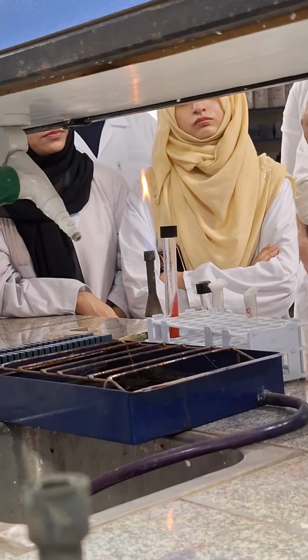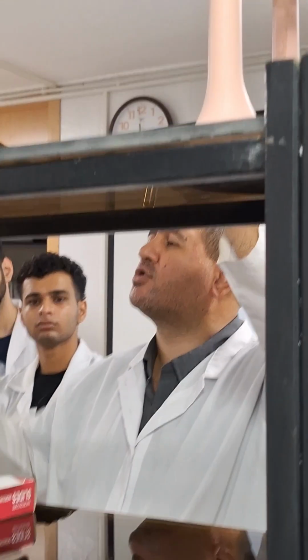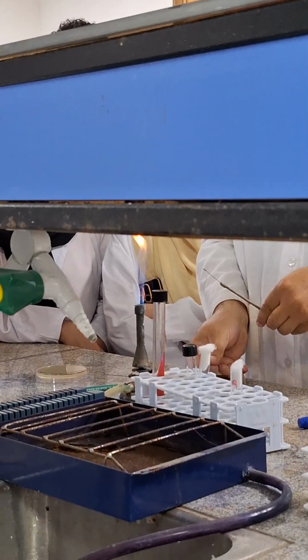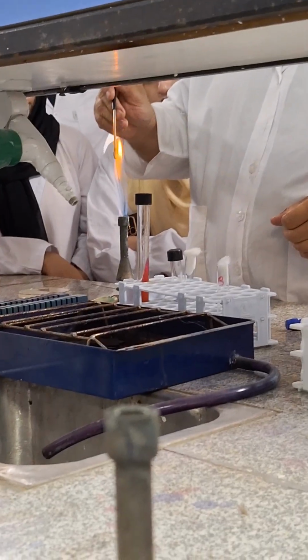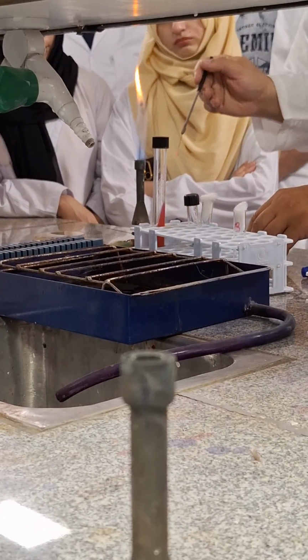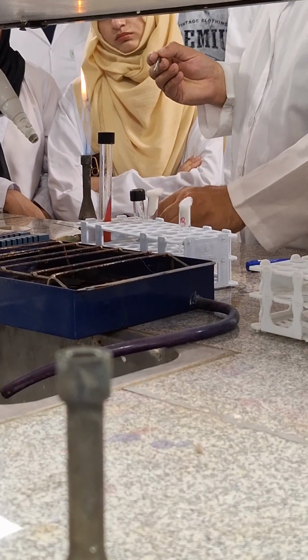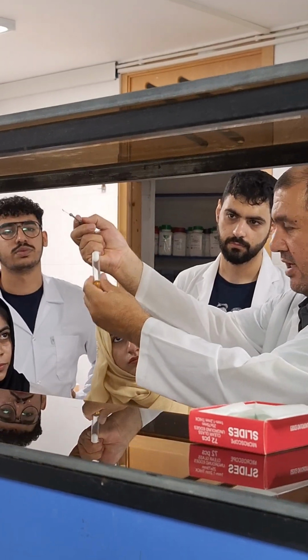To culture in liquid media, you can use loop or needle, both. Take the tube, remove the tissue or cap of the tube, okay?